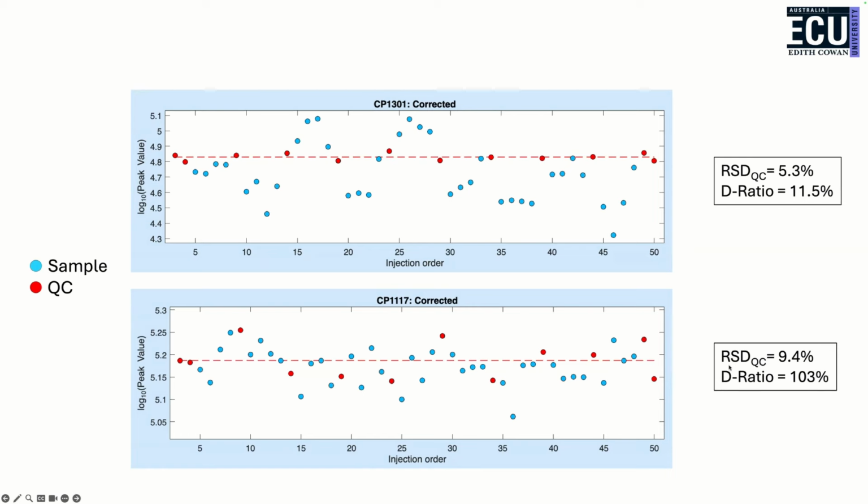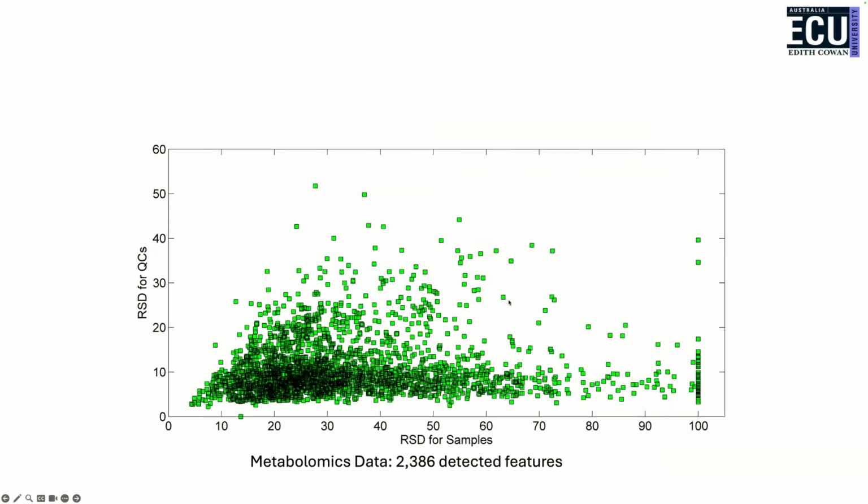So this is where it is important to look at the repeatability of the measurement, the instrument, but also the context in terms of what that metabolite is measuring biologically and whether that's of interest. The RSD is probably more the area where the analytical chemist gets obsessed, whereas the data scientist and the statistician are going to be far more interested in the information content in that data, in that peak.